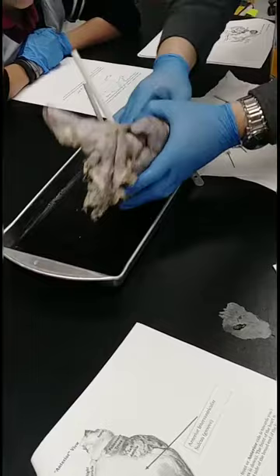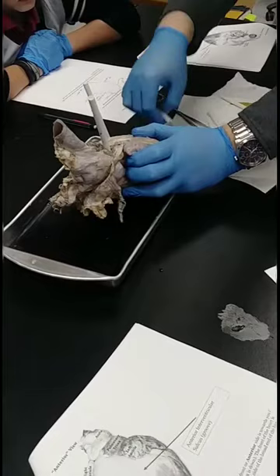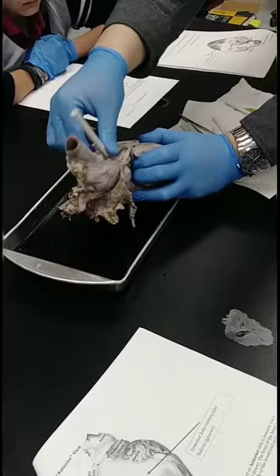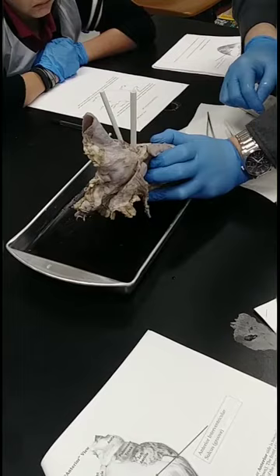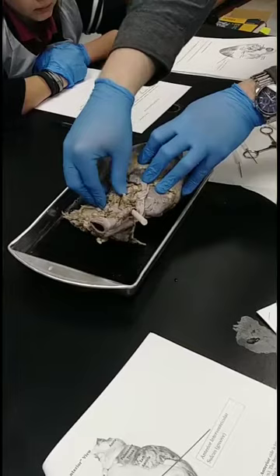Okay, now here's the posterior side. You can see how it goes down into this. You can use the scalpel to cut away some of this fat. Make sense? You're going to have to do that. So let's keep that probe there so you can see just where it goes. But cut away some of this fat here. Who's going to do that? Okay, so your scalpel. Have someone hold the heart for you and then cut it. Cut this fat off so we can see a little more of what's going on.